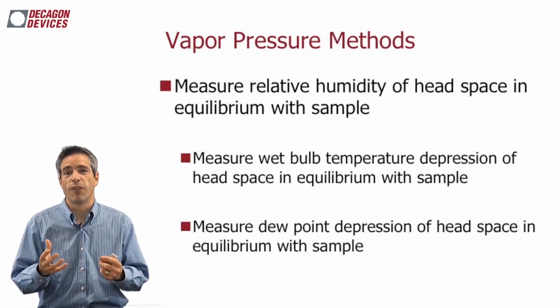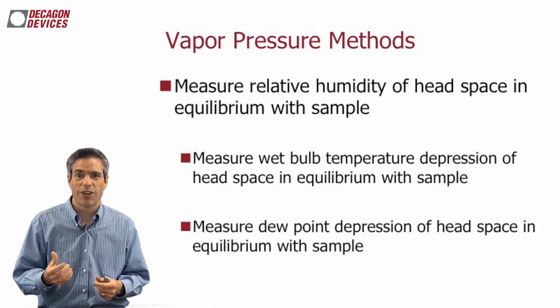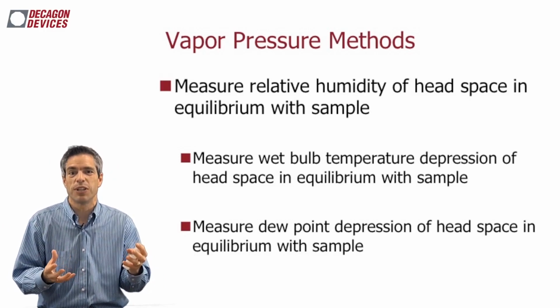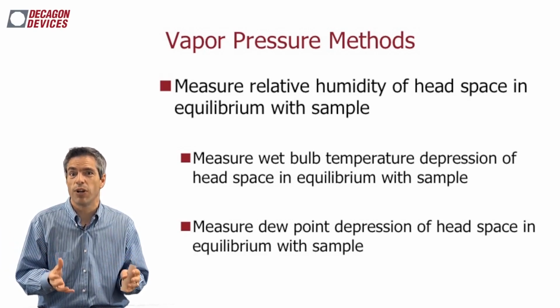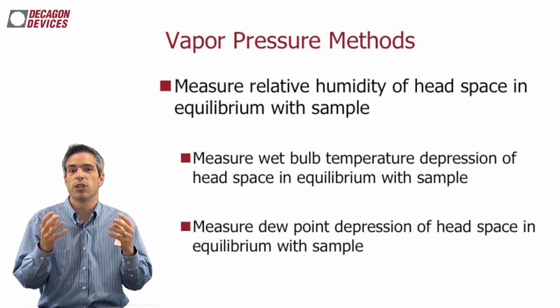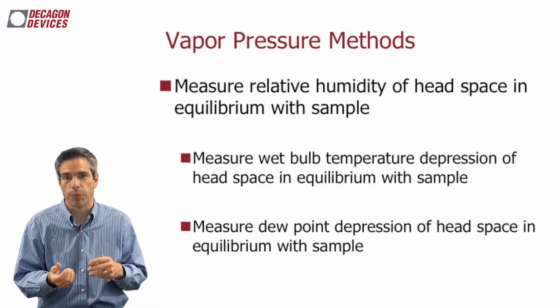Our last set of measurements that we're going to talk about before we get into some fun stuff in the applications is vapor pressure measurements. Now, vapor pressure is an interesting topic, and I would love to go into it in more detail here, but here is really a time where if you didn't catch Dr. Kobos's talk on the Water Potential 101, you really need to go back and look at that, because he showed that there's a relationship between the relative humidity in the air above a sample or above a soil, let's say, maybe in a machine above a sample, and the water potential of that sample.